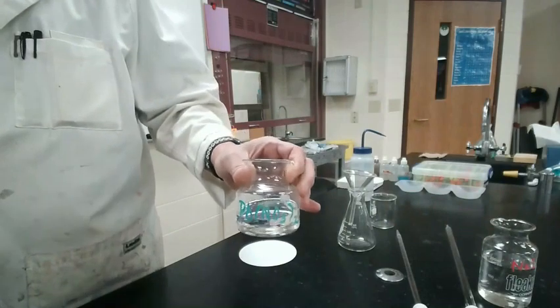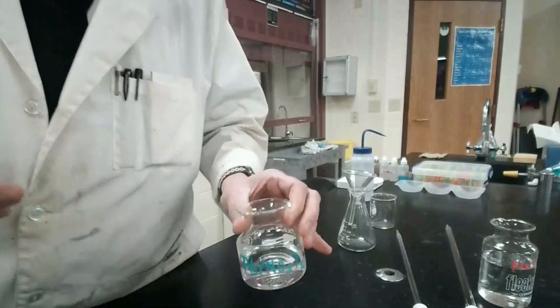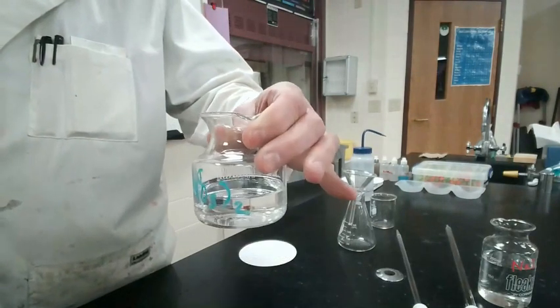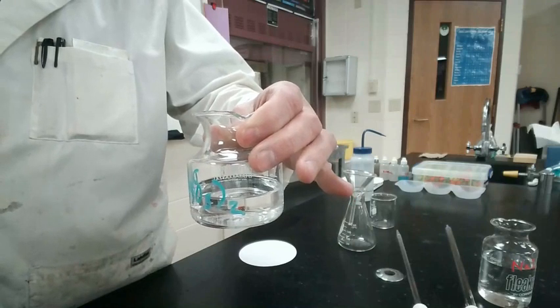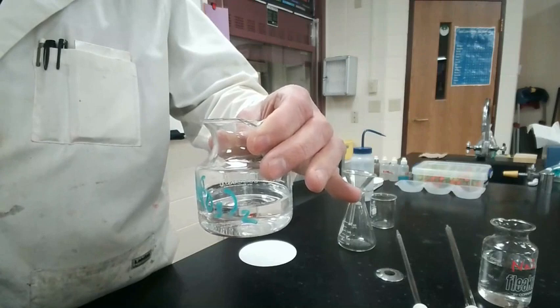Here is the lead nitrate. Again, when I observe it for odor, there is none. Okay, you're looking at another sample that is very similar to the first. So make 3 observations based on what you're seeing in this video.